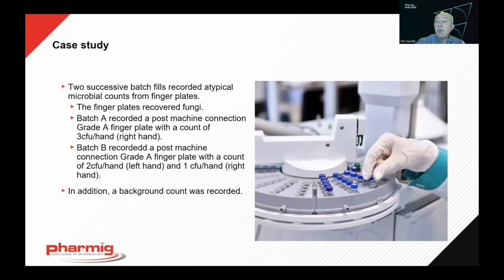And in this scenario, which is a real scenario, there were 2 successive batch fills that recorded fungi from operator finger plates. The first batch recorded a post-filling machine connection grade A finger plate, and 3 fungal colonies were recovered from the right hand of the operator.